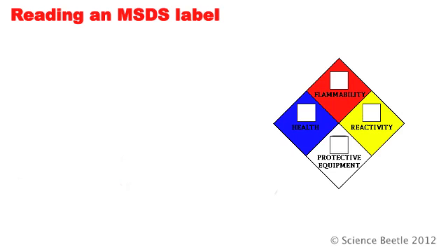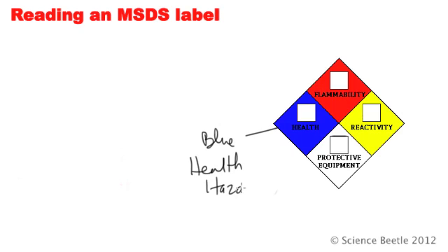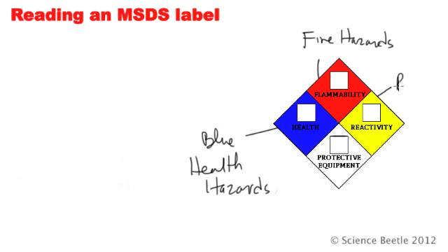When we look at the MSDS label, we've got four parts. The first part is what we call the blue part, and the blue part essentially deals with any health hazards. The red part, labeled here as flammability, deals with any fire hazards. The yellow part deals with reactivity. And the white part deals with any special hazards that you should be aware of.